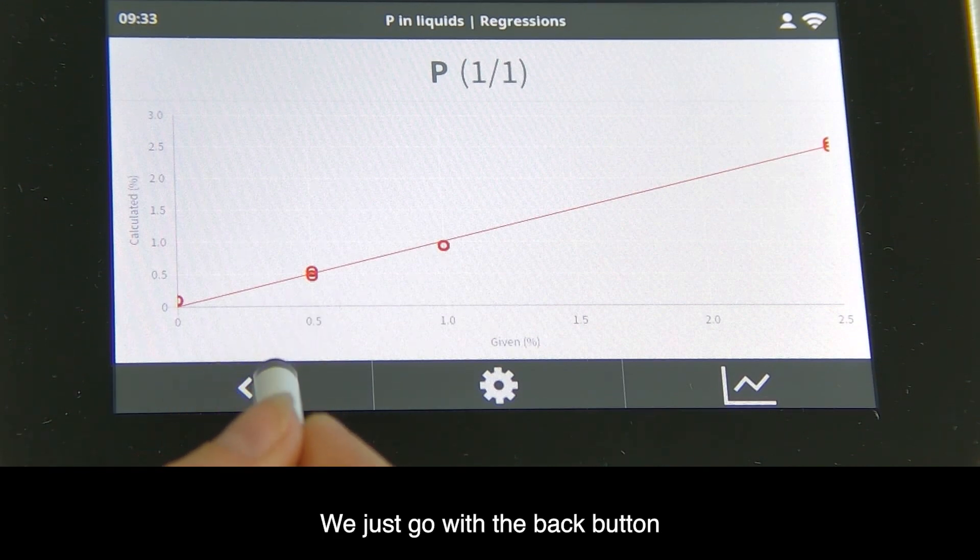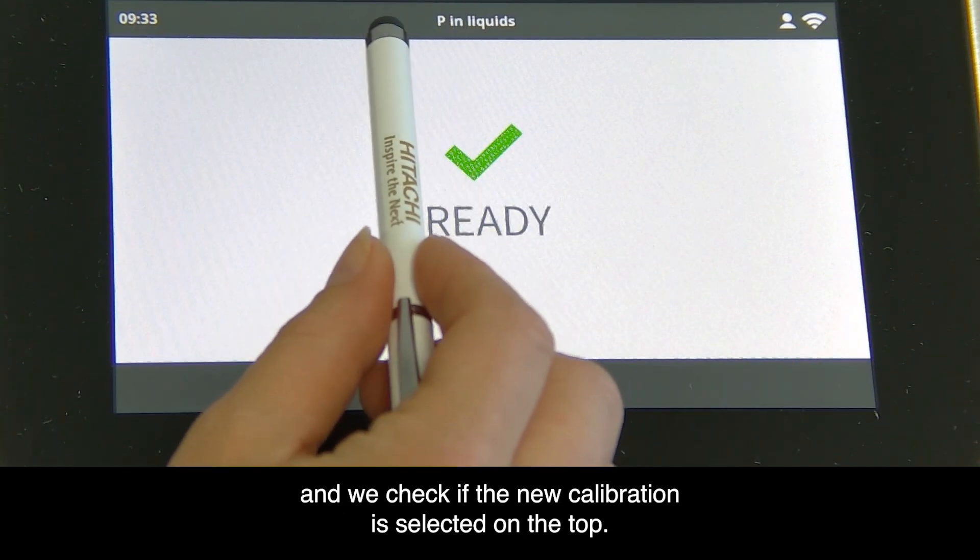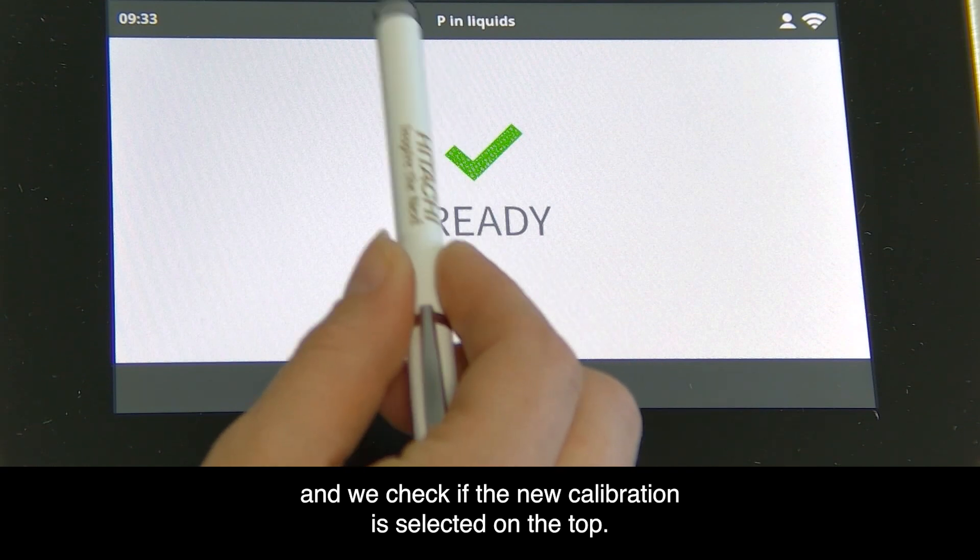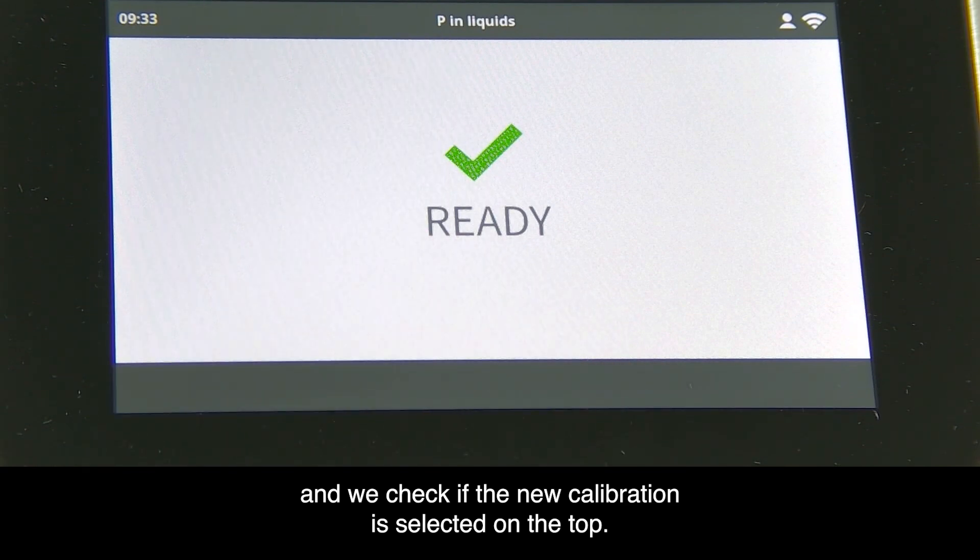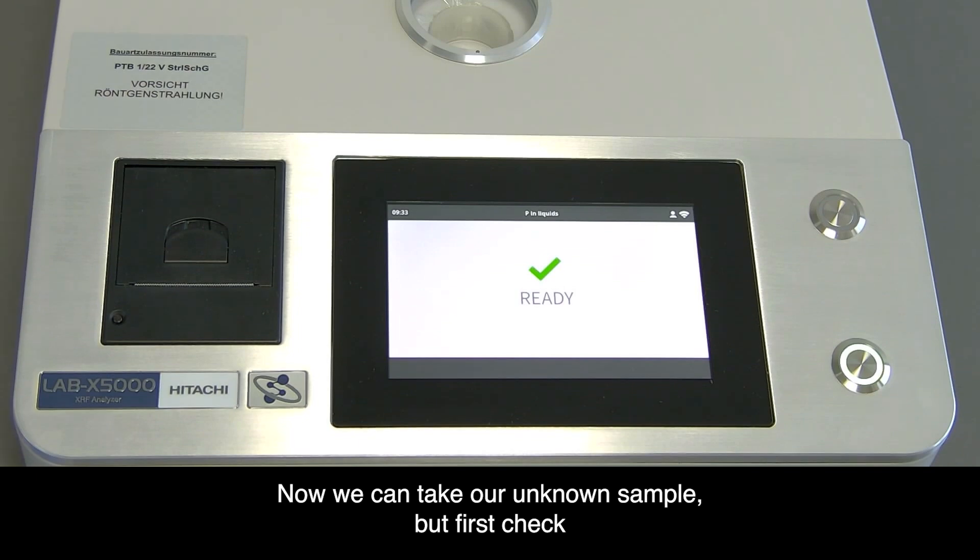We go back to our start button and check if the new calibration is selected on the top. Now we can take our unknown sample.